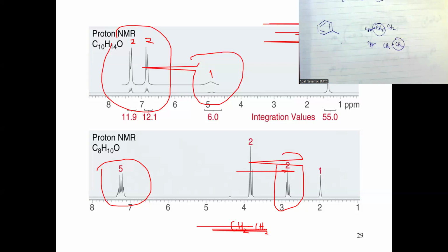Okay. And what about this 1H? Well, this 1H can be anything really. It's a CH. No, it cannot be a CH. Why can't it be a CH? Because here you have already a benzene ring. In a benzene ring, you already are occupying how many carbons? 6 carbons. Here you have 1 and 1. So 6, 7, 8. You can't use 9, right? Because your formula has C8. You have to make sure that your formula always matches your NMR proposal. So it cannot be a CH.